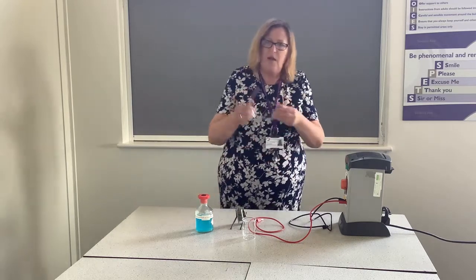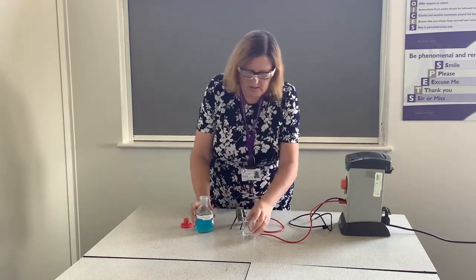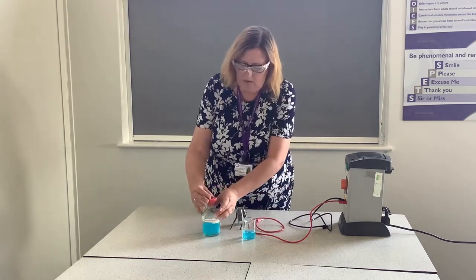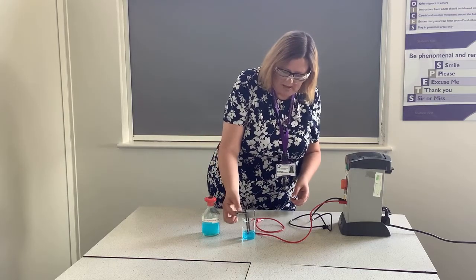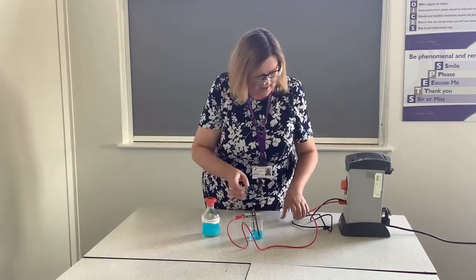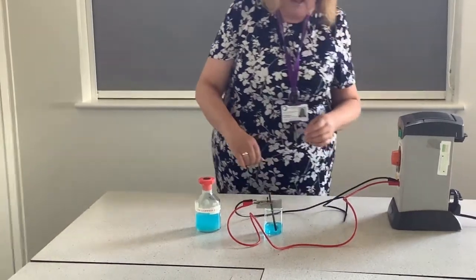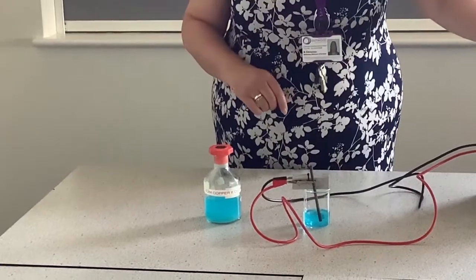Now of course because I'm carrying out my practical I will wear my safety glasses. We're going to simply pour some of the copper chloride into our beaker — just enough so that the electrodes will be touching into the actual liquid. I'm going to place those in place and then attach the crocodile clips at the end.